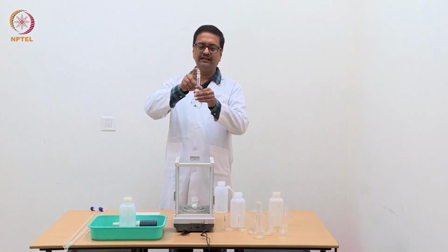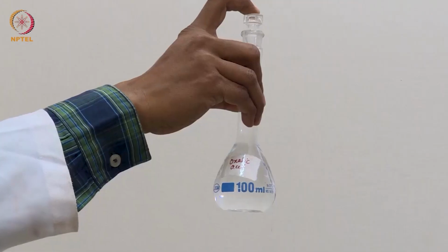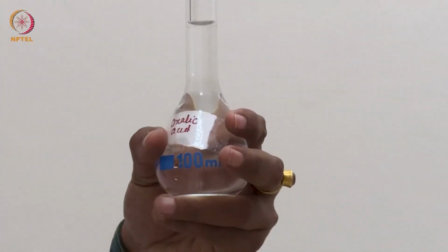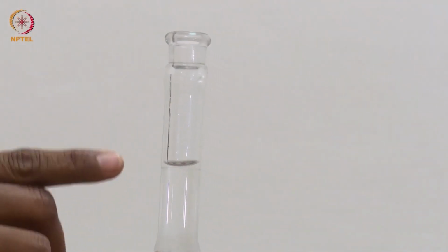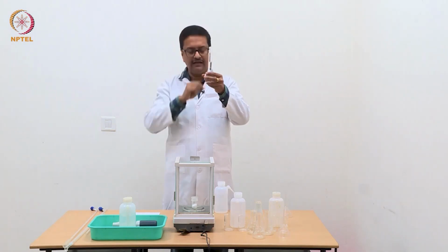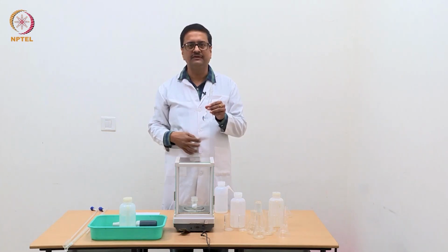Now, we should put a lid and then shake it upside down a couple of times so that the solution is homogeneous. So, this is how one should prepare the primary standard, and what you see is the lower meniscus of this water is touching that mark, and now this is my primary standard oxalic acid for the standardization experiment.